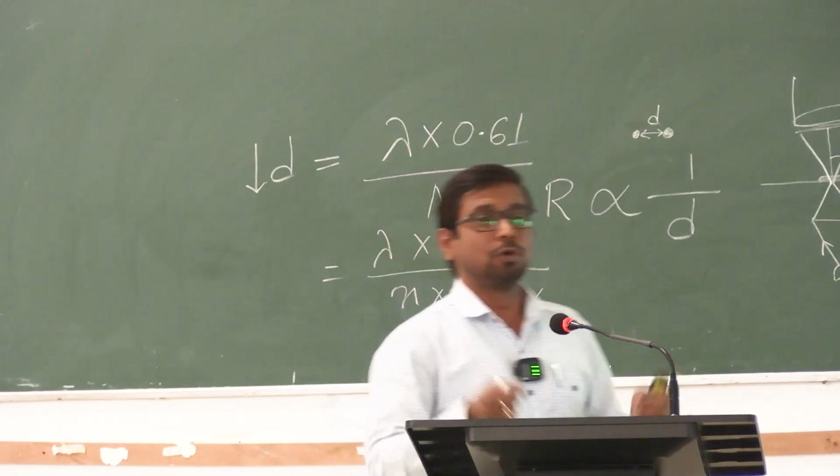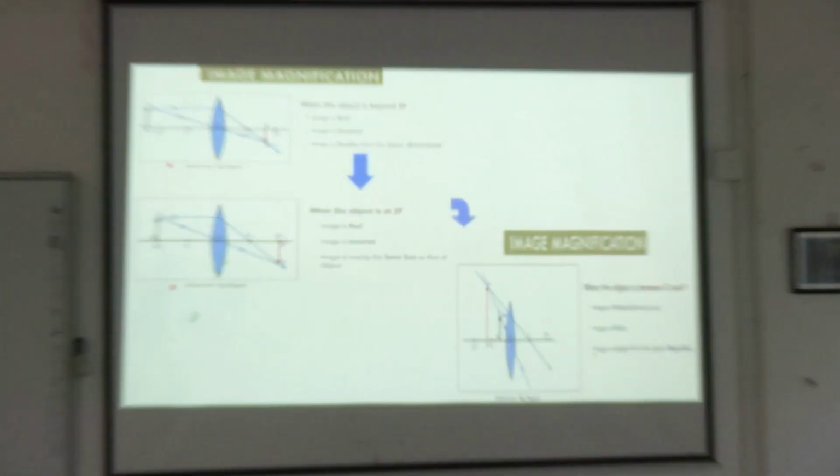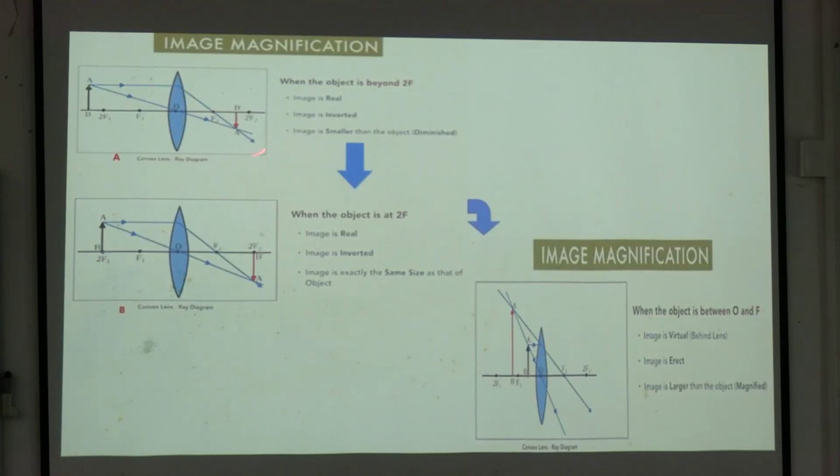Again I will come to magnification. Here you can find when light passes through a lens, this portion is called the optical center O. When light passes through the optical center, it goes as it is, but if the light passes elsewhere than the optical center, it will deviate, come to the other end of the lens, and cross each other, and it will form an image.